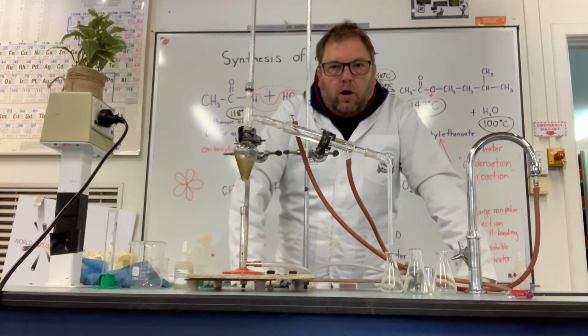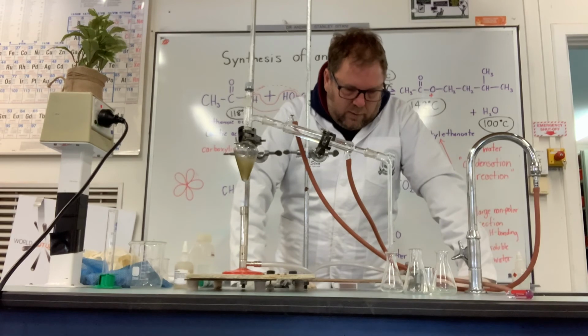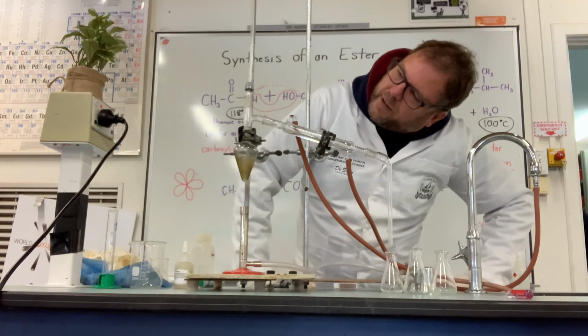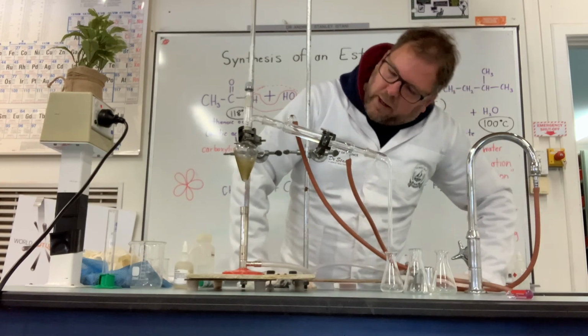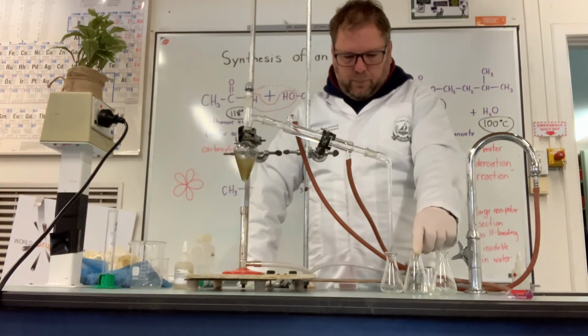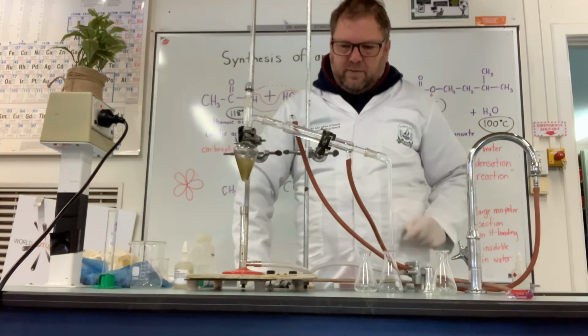120 degrees now. So I would think before that was sitting at, yeah, just below 100, which might have been the water. Okay, that's going up quite quickly. There's a bit of a pause there. So that might be the end of the alcohol.